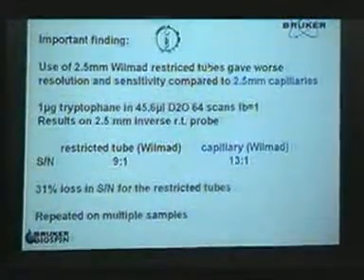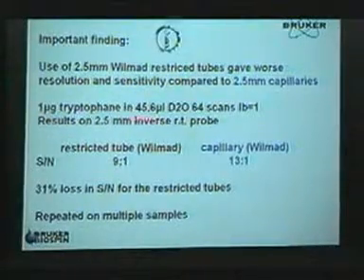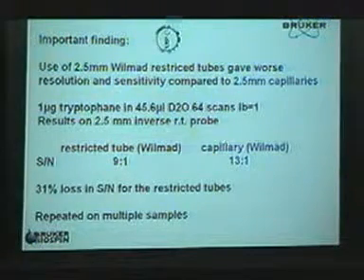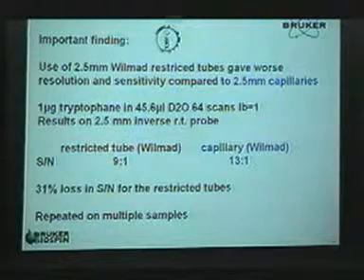Band restricted tubes. And for example, for the same quantity of product, in the application lab in Karlsruhe, they have tested the difference in signal to noise, and they have found that with the capillary, they have a better signal to noise than with the restricted tube. Next slide.